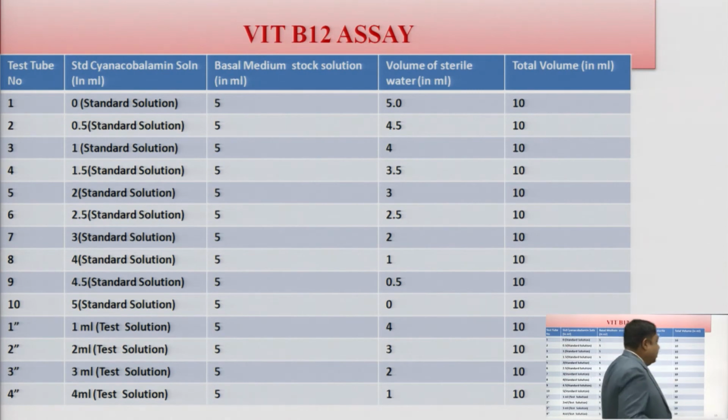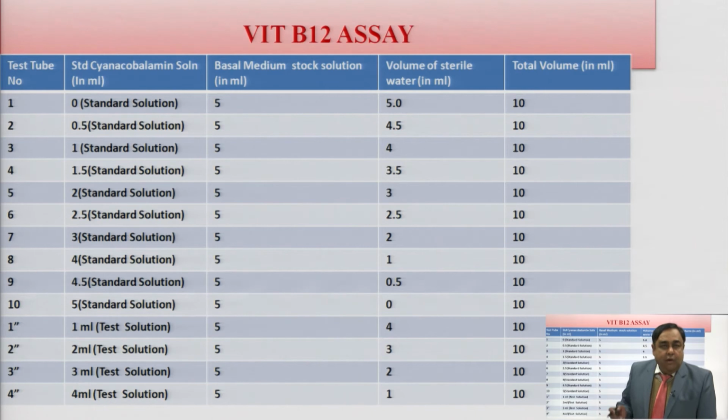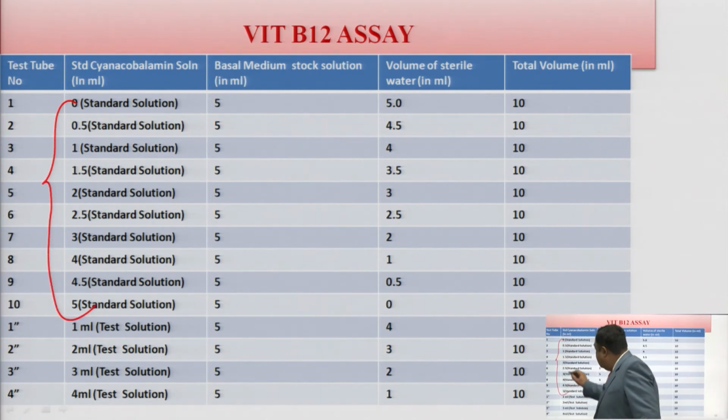This is the process which we adopt for the titrimetric method also. Again, this is for the standard, and this is for the unknown or the sample.